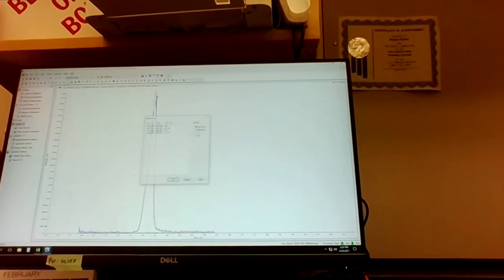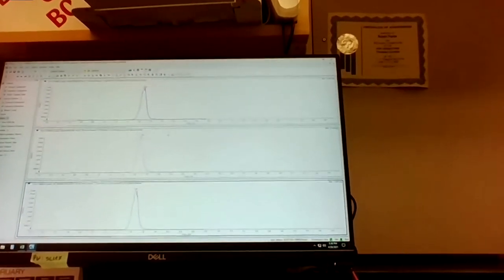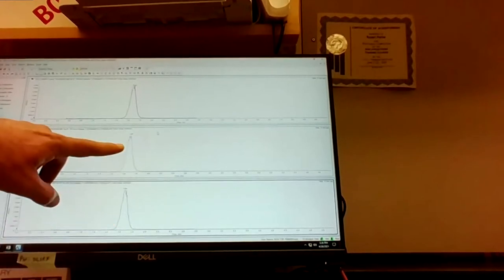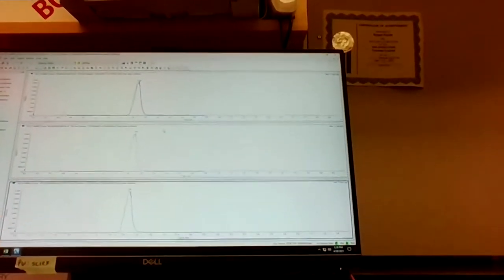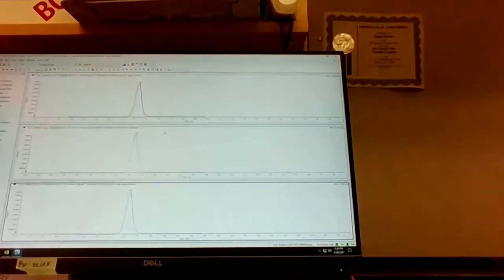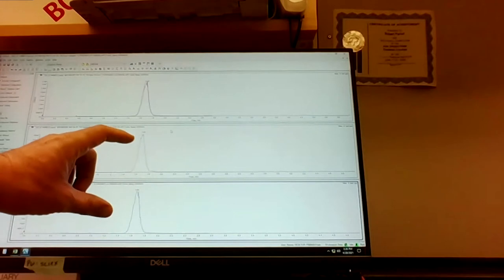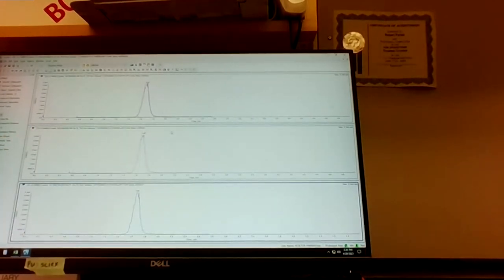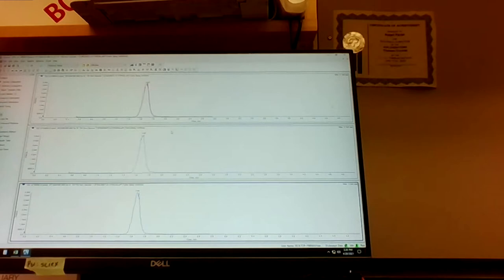It's monitoring both compounds here. You can notice that the internal standard on the bottom comes out exactly the same time as our compound of interest. This is crucial in mass spectrometry because things in the source region where it's ionized can change — fluctuations in power in the building or what have you. Having something that elutes at the same time allows compensation for differences in ionization. We have a method here where our compound comes out at 1.64 minutes. Once we have our HPLC method, we're able to then start to process and analyze samples.